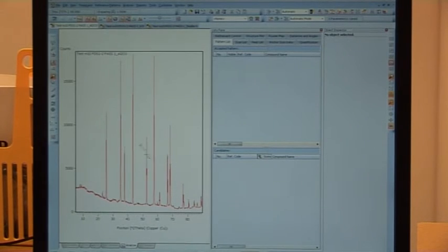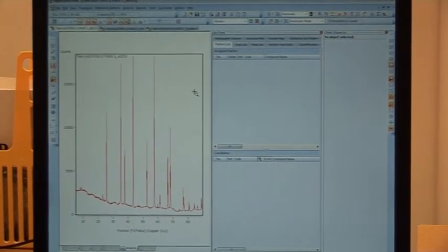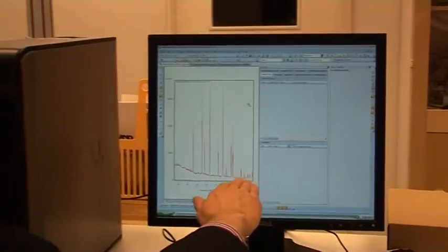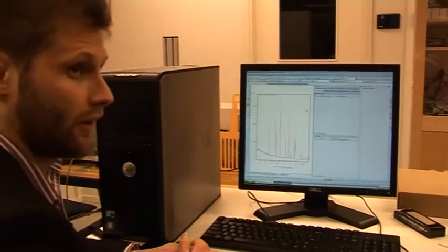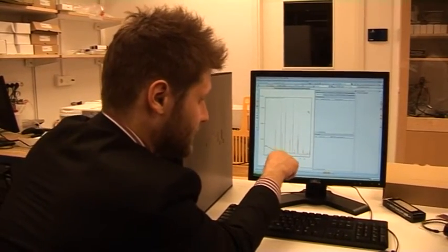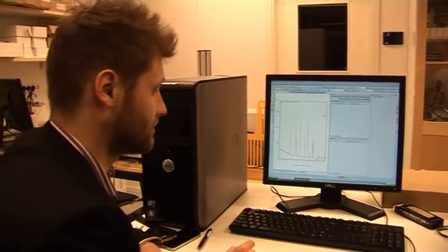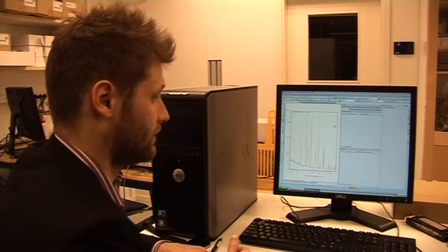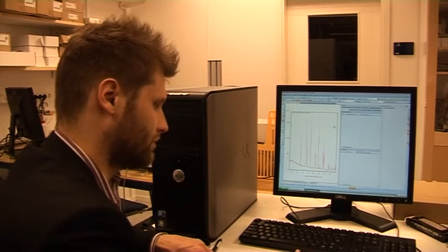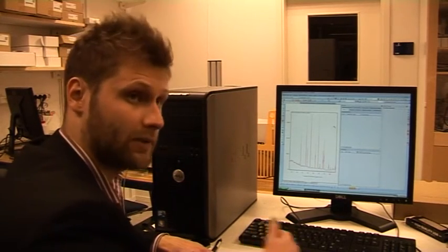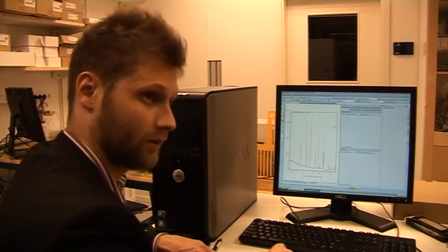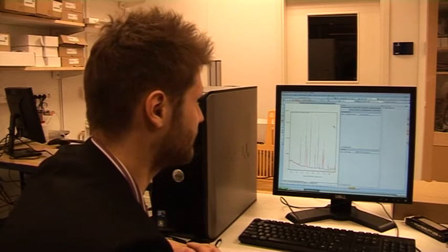In order to continue, you as an operator have to do some steps. The first step is to determine the background, so where you want to draw the background line. You need to in order to evaluate the height of the peaks and compare that to the reference data. Then the second step is to try to mathematically describe your peaks. Basically try to fit the peaks and put some kind of a mathematical model to each peak to evaluate the area of the peak and compare it later with the reference data.